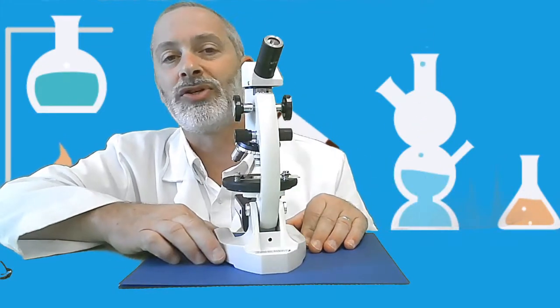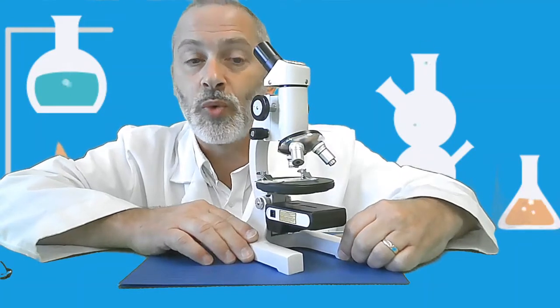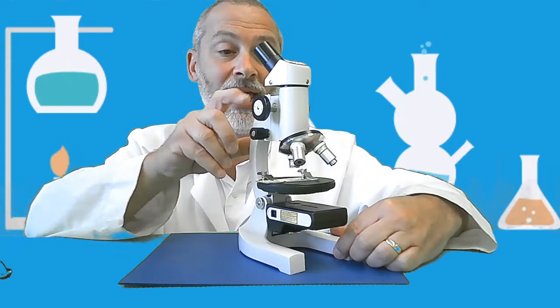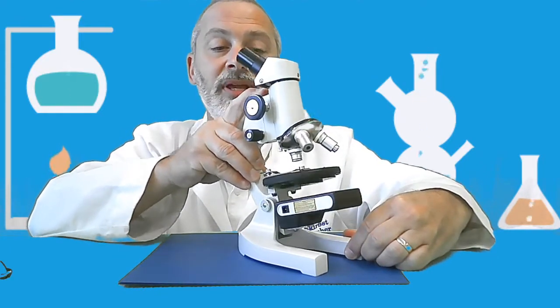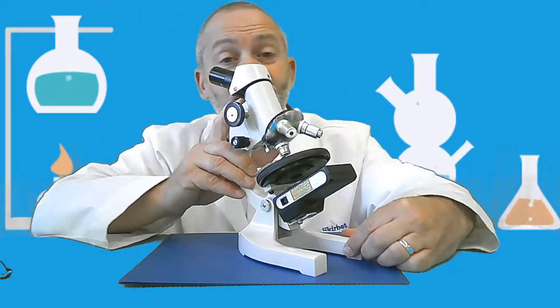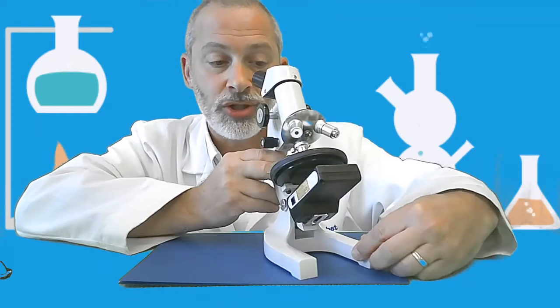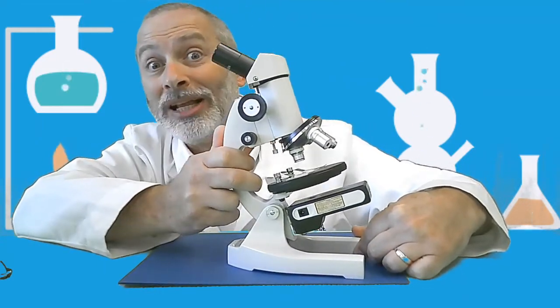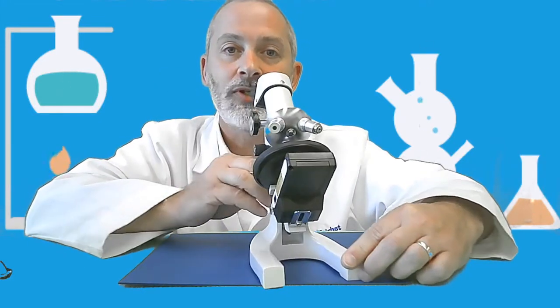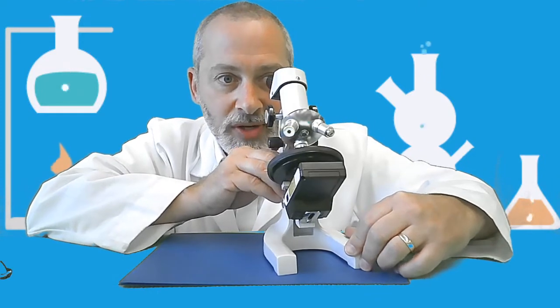Don't use a microscope this way, but rather use the microscope this way, so the arm is facing you. Good reason for it, by the way. The entire arm can tilt toward you, so that you can be sitting comfortably in your chair. You can arrange and position it almost like a recliner chair. You can position the arm of the microscope so that you can view it comfortably from where you are sitting.